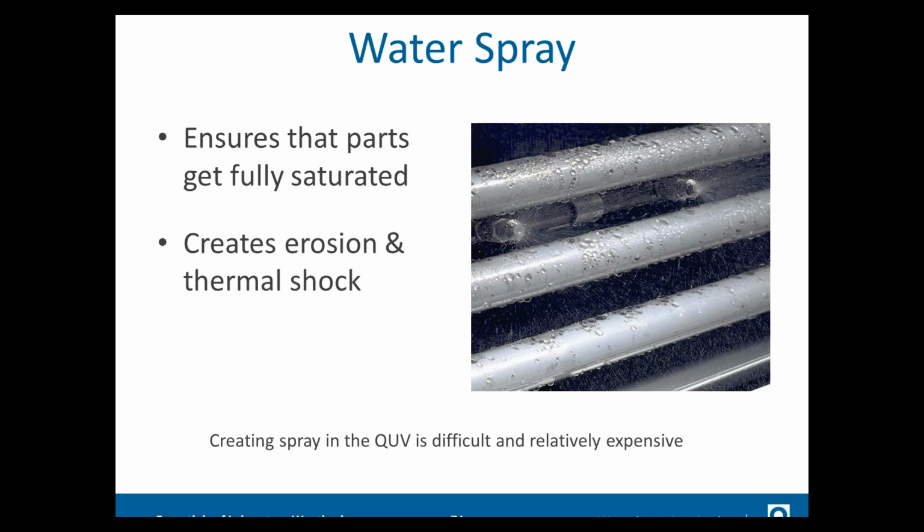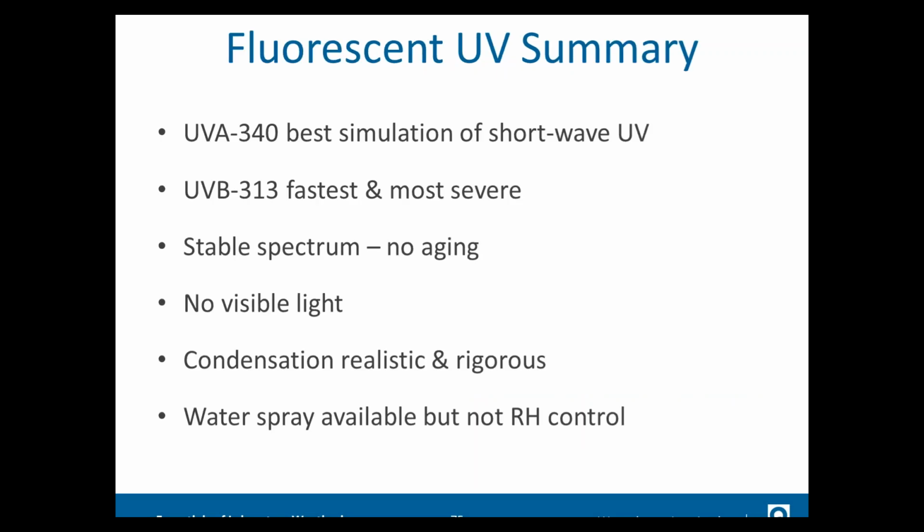Water spray is a little bit more difficult in the QUV. It's a very high rate of water, but most tests do not require water spray.